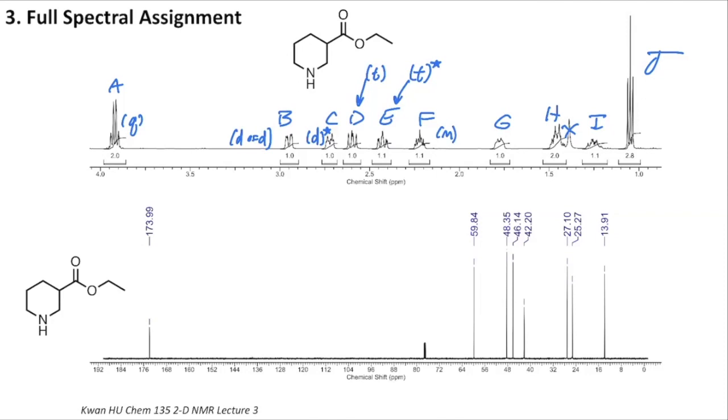And then as we move along to G, it's not getting any easier. This one is definitely what I would characterize as super lumpy and weird looking. So again, I'm just going to call this one a multiplet. Not sure what's happening there. Same with H. There seem to be two kind of taller spikes sticking out of it, but there's a lot of complex things happening toward the base. So we'll call that one a multiplet as well. Same with I. Now J, finally, we have a return to something that looks like normalcy. It looks to me like a very fine, well-resolved triplet. No big deal there. Finally, we're kind of ending back in our comfort zone.